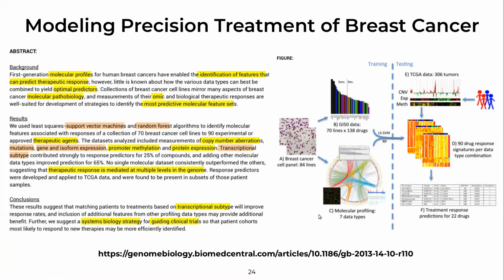Maybe this map right now makes sense to you about the coverage and the mutations being shown, and also the molecular profiling of breast cancer. The coverage is very important when it comes to next generation sequencing, because a good coverage definitely gives you all the details about the data.